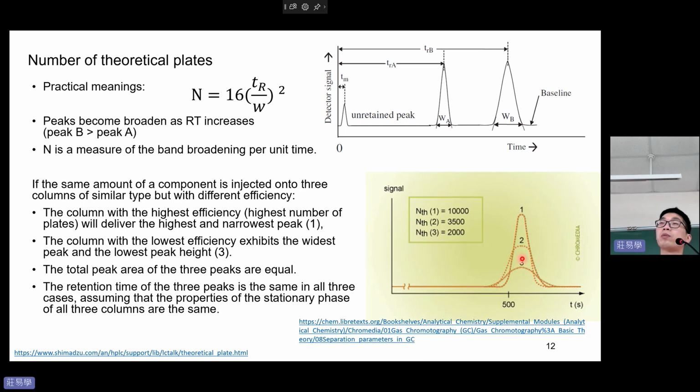好，我再强调一下哈，这个是 chromatography 另外一个特性。如果你现在用三个不同的 column，然后你注射同一个样品，就代表它们这个 target analyte 的浓度是一样的。打进去之后呢，虽然它们的 peak shape 不一样，但是如果你去做积分的话，这3个积分出来的面积会非常相近。这个 peak 比较 broader，并不代表它的 peak area 会比较低，积分出来会是一样的。这是 chromatography 另外一个特性，大家要注意一下。All right.